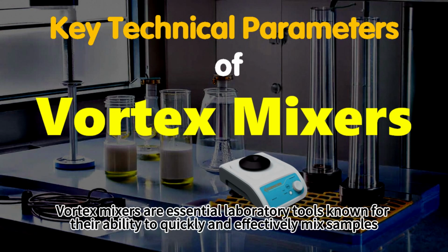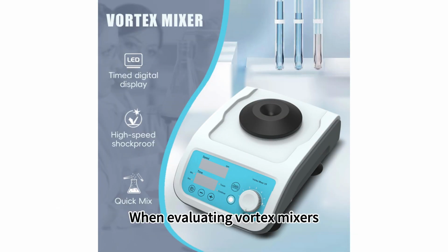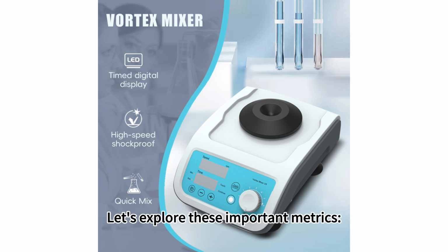Vortex mixers are essential laboratory tools known for their ability to quickly and effectively mix samples. When evaluating Vortex mixers, several key technical parameters are crucial for assessing their performance and suitability for specific applications. Let's explore these important metrics.